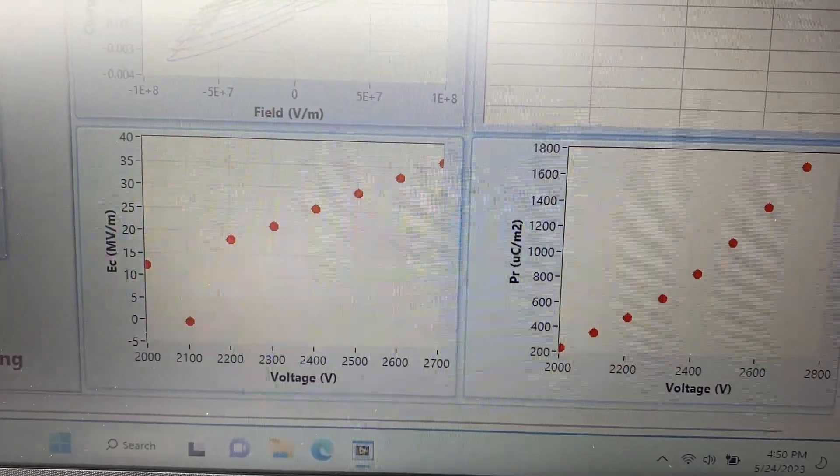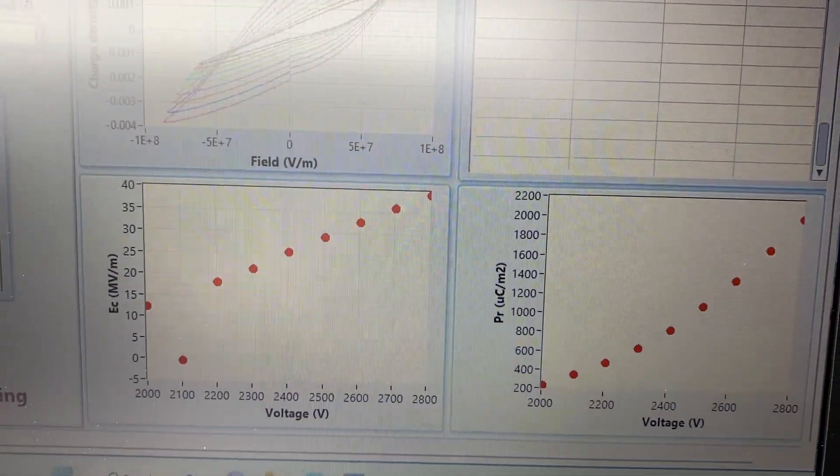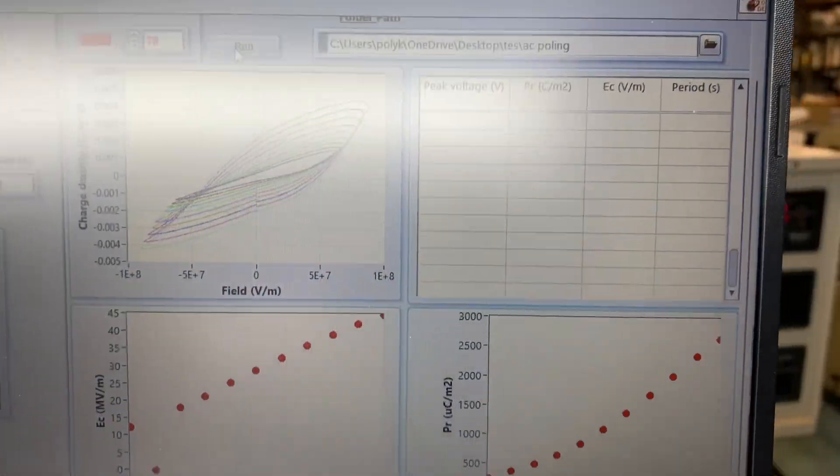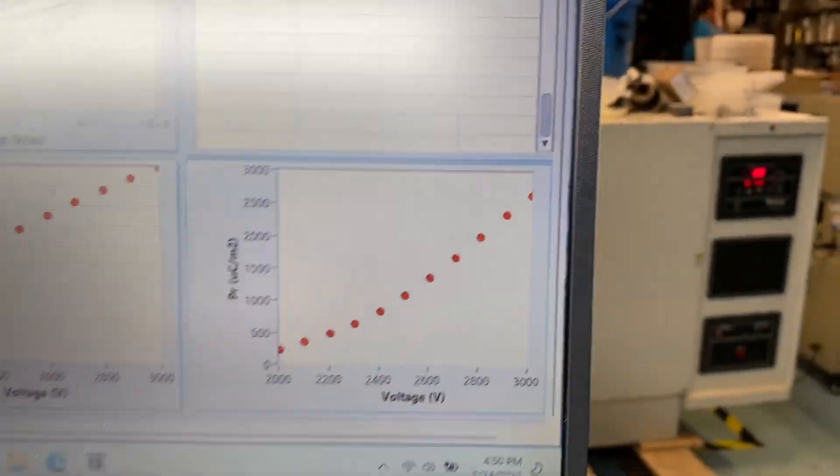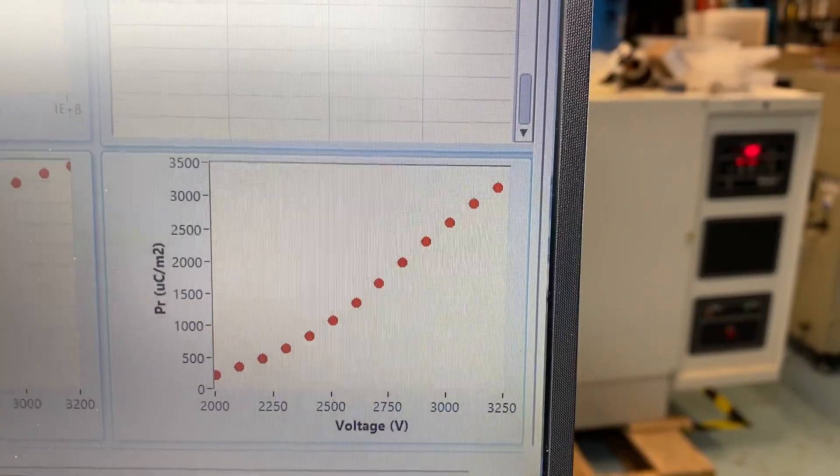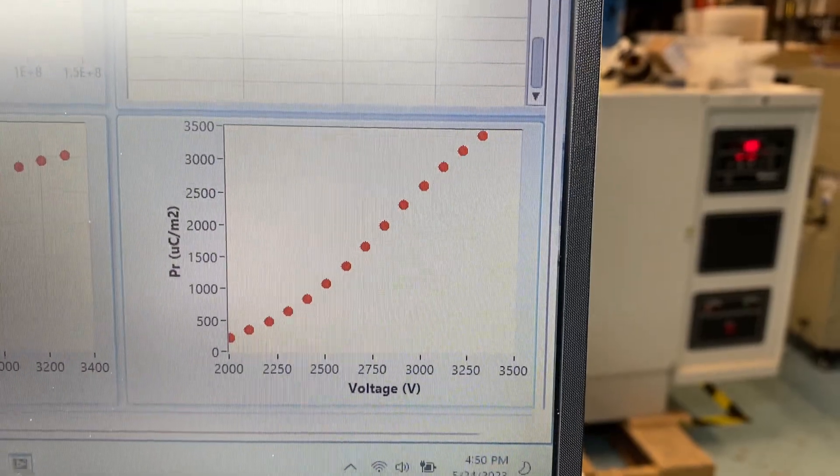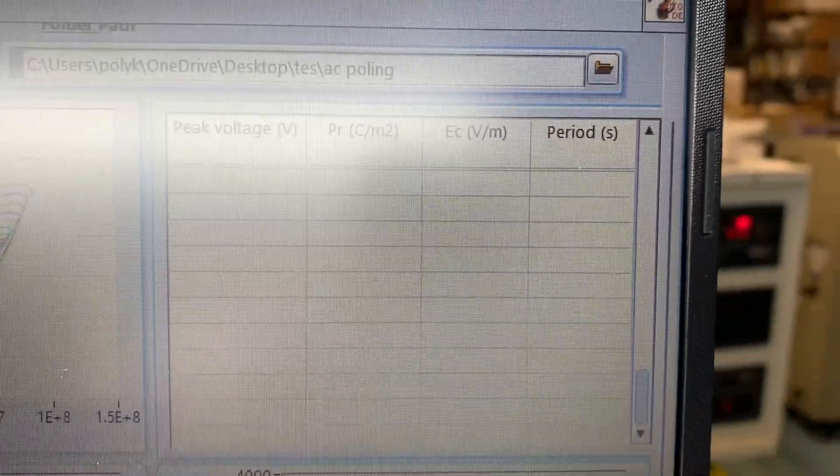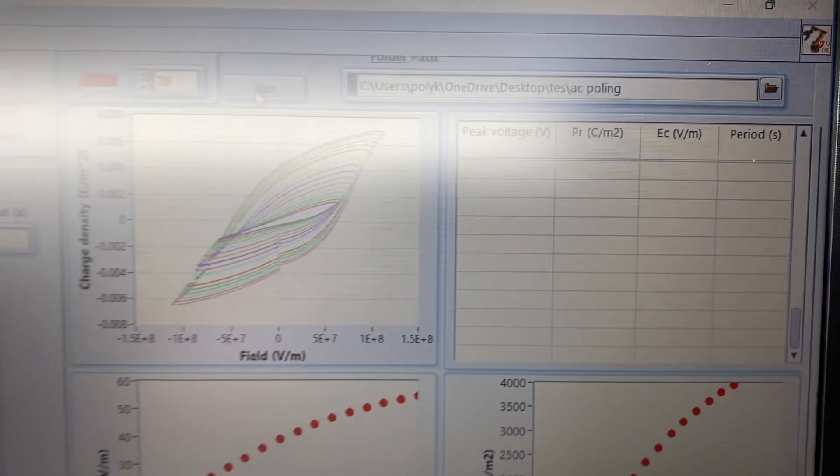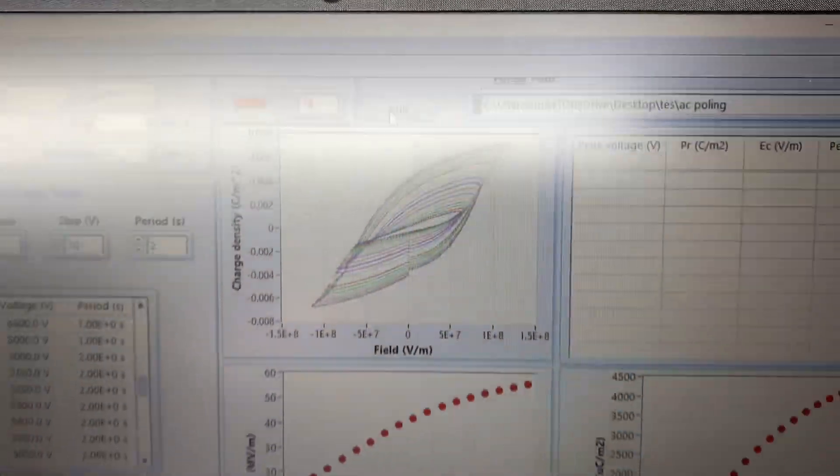This is the voltage, the EC coercive field in that loop. And over here, it shows you the PR as a function of voltage. In the table, it gives you a summary. All these results will be saved in the data.